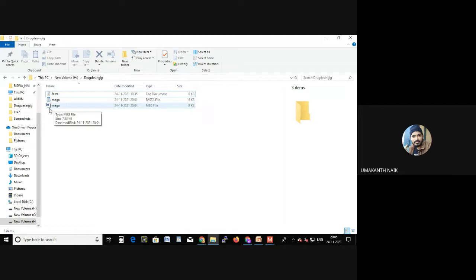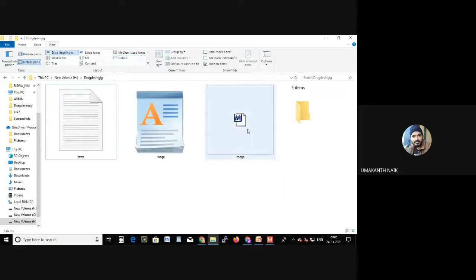So you see the icon is in MEGA now. Now it has changed. Let me show you. Now the icon has changed, right? It's showing the MEGA software tool only. As how the PyMOL shows, this is also showing in MEGA. Is it clear, Kasturi, Preeti ma'am, Sampada, Arvind?